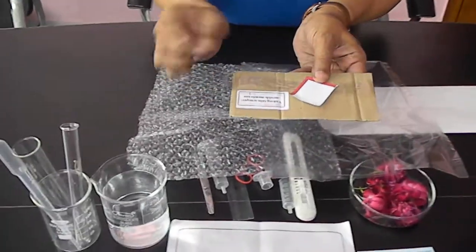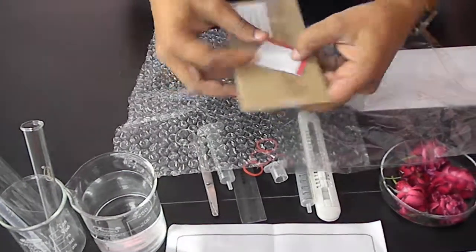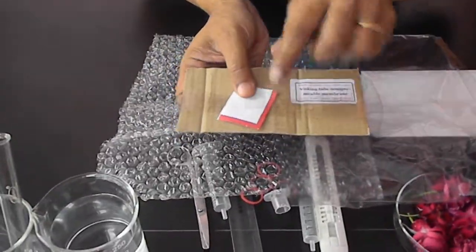This is the whisking tube. It comes in different requirements like 1 meter, 2 meter. This is the membrane.